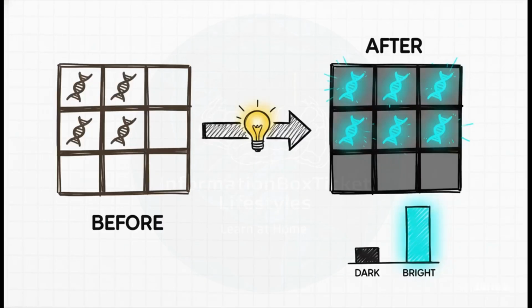So once the amplification is done, we move on to the final steps, seeing the results and counting them up. This is where those fluorescent probes we added earlier do their job. They hunt down and stick to any amplified DNA, which basically makes the positive partitions light up and glow. The machine then just scans everything and does a simple count.